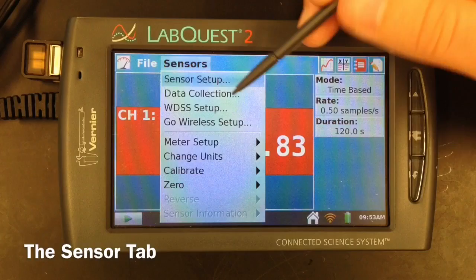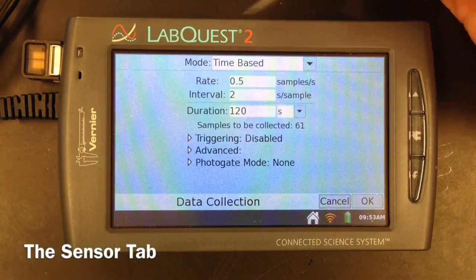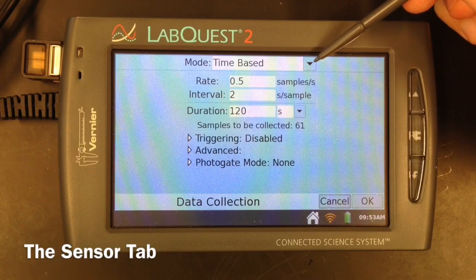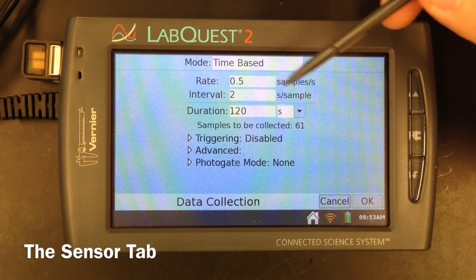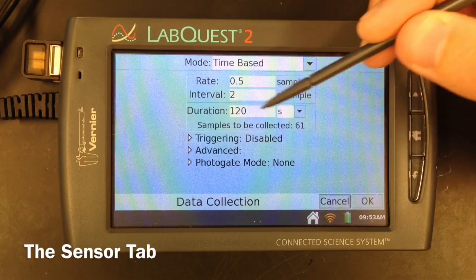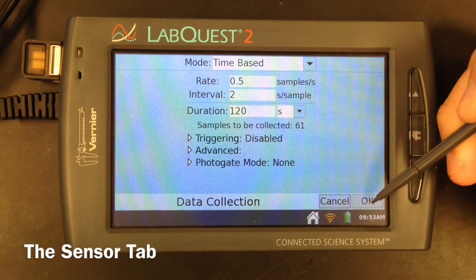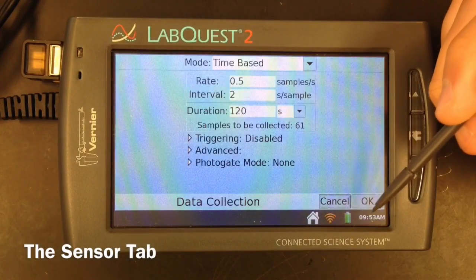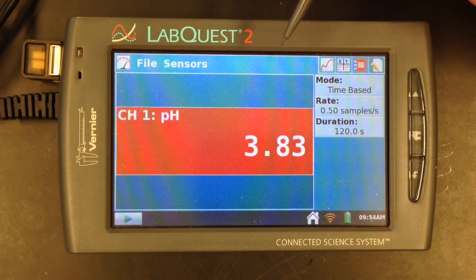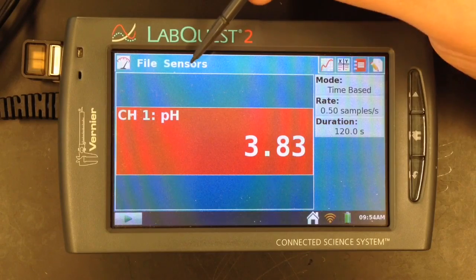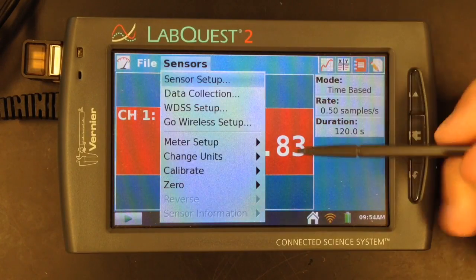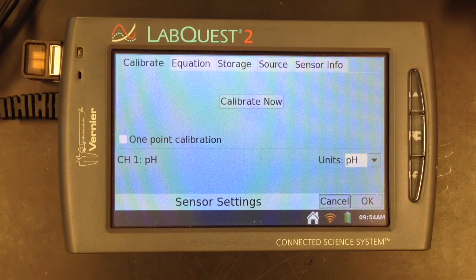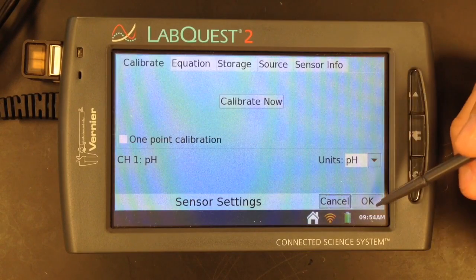Under the sensors menu as well, there's also a data collection option, and this is where you will change all the parameters of your data collection, such as the type, how often you collect samples, as well as how long it happens — and this is the one that you will be changing most often. You can also access that option by tapping anywhere in the box to the right. Should your sensor need calibrating, that is also located under the sensor menu to calibrate, and the type of calibration would vary based on the sensor that you have plugged in.